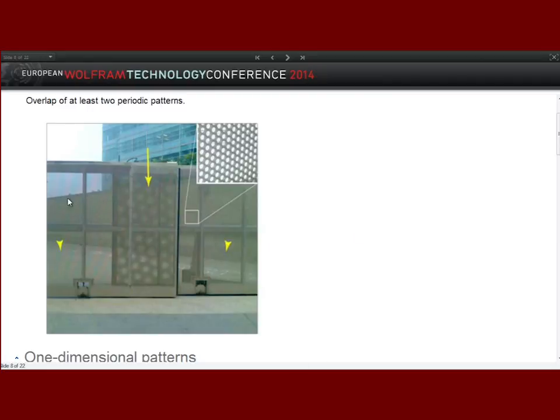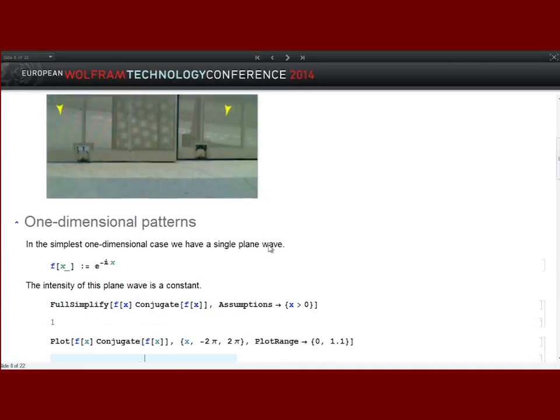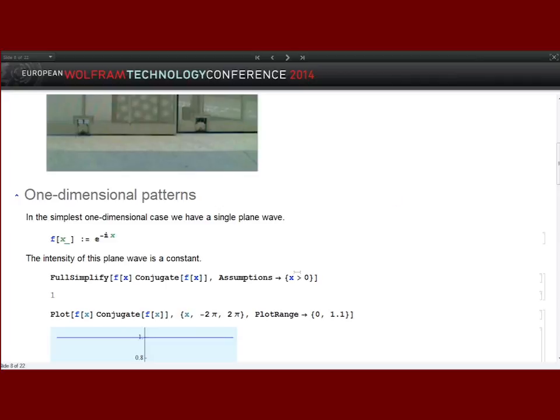So we cannot identify that here in the image, but under certain conditions, certain angle and so on, we could actually see this. So in a certain sense, this acts as a telescope or something like this, because it really gives you an improved resolution. So how do we take advantage of this?